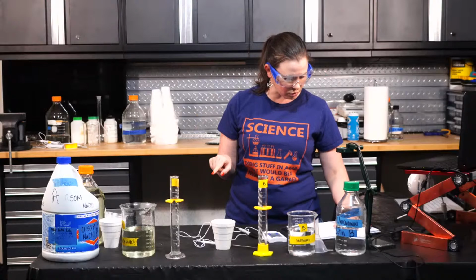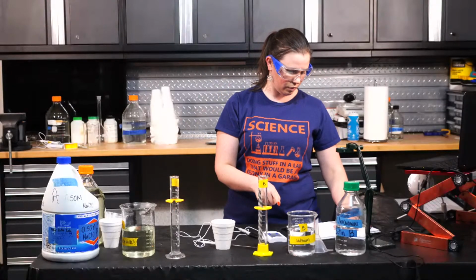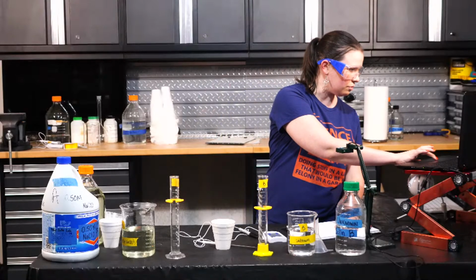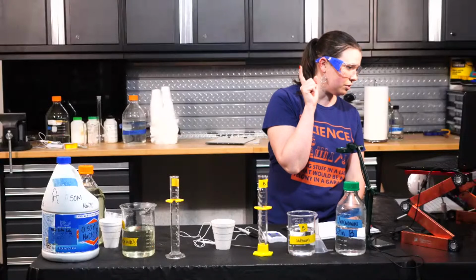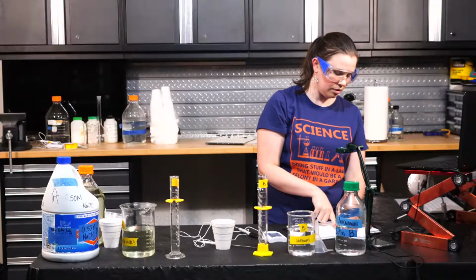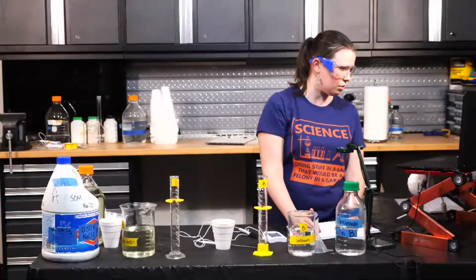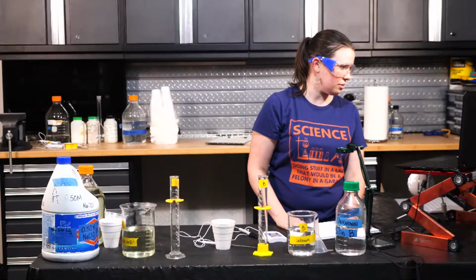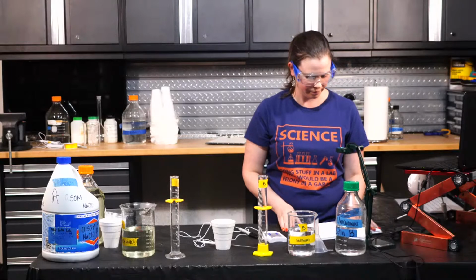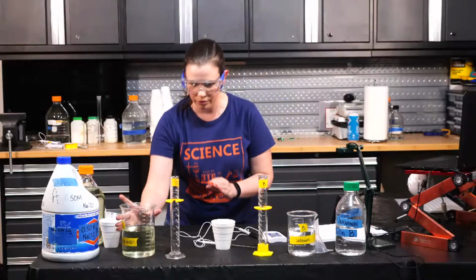For level 2, it's going to be 15 milliliters of bleach with 35 of the solution B. Did you hear what I just said about how I can't measure 5? I have a 10 milliliter graduated cylinder in my room. I just have to go get it. So can we still use 5? Yeah. I just figured I would skip that one for now and give you guys some data to start working on, and then I'll do that one last. Does that work? Okay. Yes. Okay. So we'll do 15.